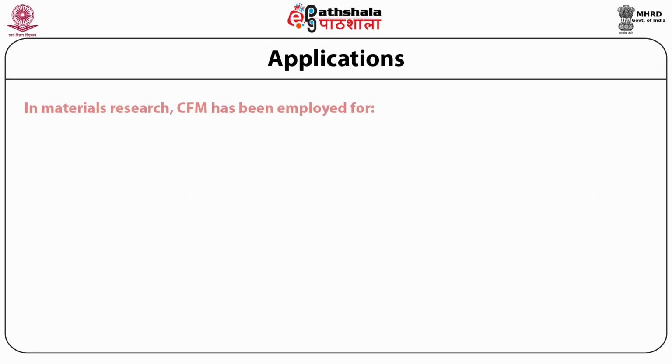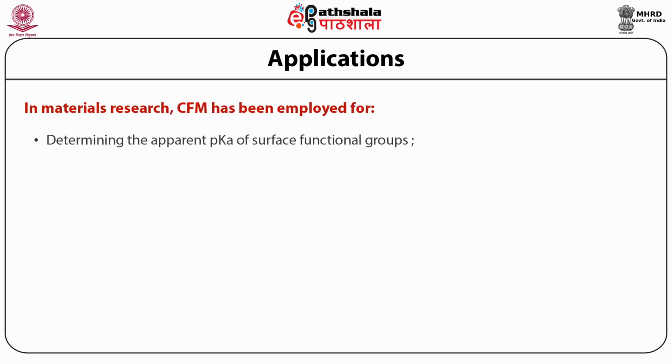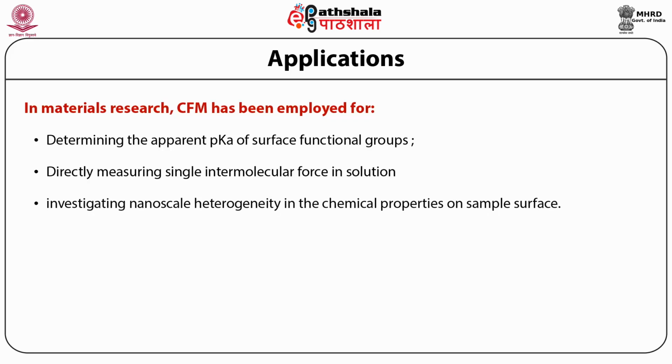So far, in materials research, CFM has been employed for, number 1, determining the apparent pKa of surface functional groups; number 2, directly measuring single intermolecular forces in solution; and number 3, investigating nanoscale heterogeneity in the chemical property on sample surfaces.